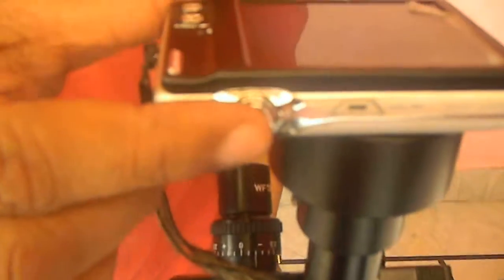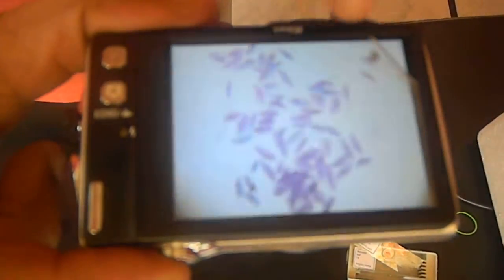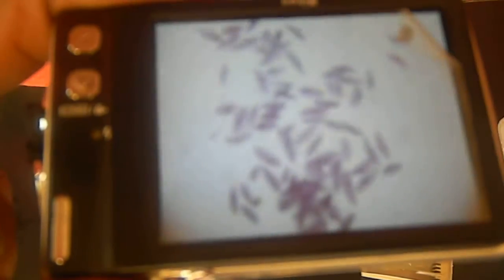Now this camera is ready to click. Very easy. Just press it. You can see the image. There is a center spot will be there. It will make a sound as per depends on the camera. And then the image can be clicked. Now the focus is there. One photo is clicked.